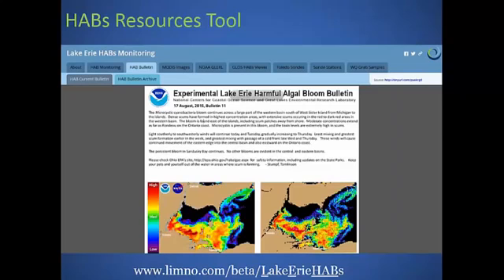And again, we're trying to make tools that make that easy, to show bloom present, bloom not there, and those online sensors even allow them to track that data even when they're at home. If they want to see the trend, if they're coming into a shift, you can just check on the website and see what's happening. For the superintendent, that's not going to be there all the time, he can check in and call in and see that raw water data as well. So for source water that is changing hourly, daily, it's very valuable to help track those changes wherever you're at.